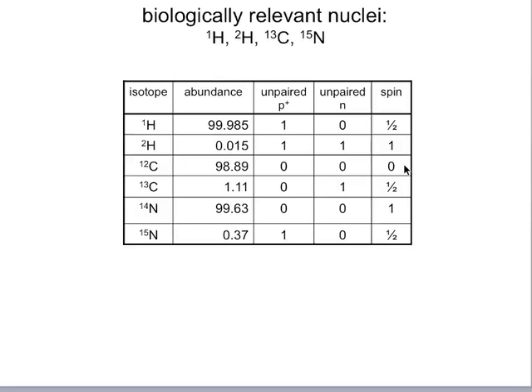So instead, we have to enrich the protein with carbon 13, which is much less abundant, but we see that's our NMR active nucleus. Again, the same thing is true for nitrogen. The most abundant isotope of nitrogen is not NMR active, and so we enrich the protein, and I'll mention that briefly in a second, with an isotope of nitrogen that is sensitive to NMR frequencies.